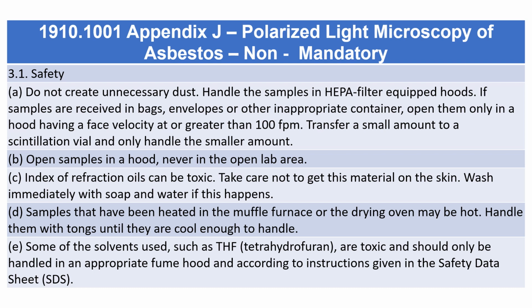E. Some of the solvents used, such as THF, tetrahydrofuran, are toxic and should only be handled in an appropriate fume hood and according to instructions given in the safety data sheet.